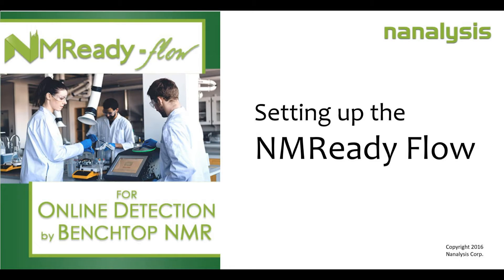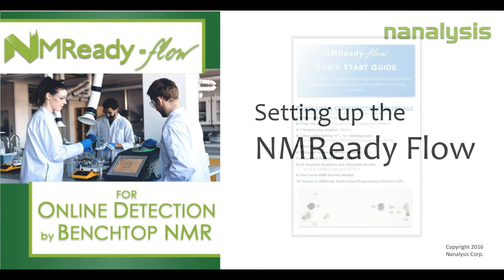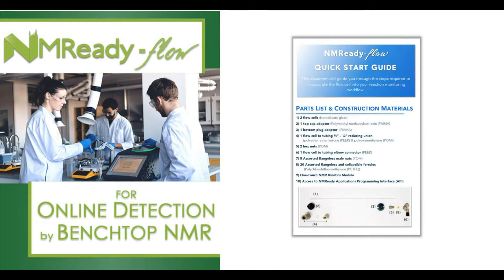Hello and thank you for your interest in analysis NMR technology and its use within flow systems. In this video we will look at what hardware comes with the NMR-Ready flow kit and how to install it on the NMR-Ready 60E spectrometer.